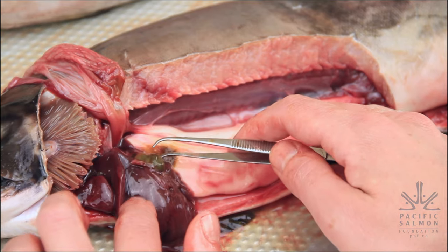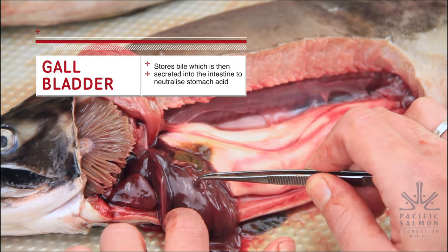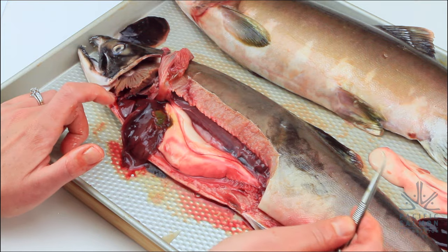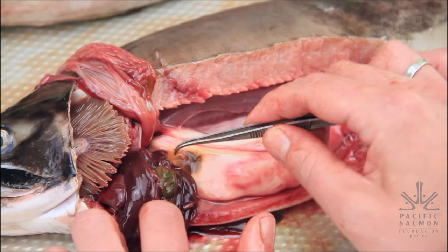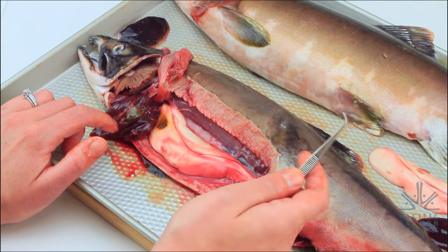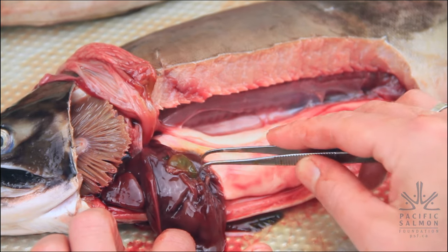Now we can see this green organ here — this is the gallbladder. It was attached to the stomach and is also attached to the liver. The gallbladder in a fish works similarly to yours: it collects and stores bile from the liver, which is then used by the intestine to help digest fat. The color and fullness of the bile in the gallbladder can tell us how recently the fish has eaten. If it's yellow and almost empty, the fish ate within 24 hours. This one is a bluish-green color, meaning this fish hasn't eaten in about a week — which makes sense based on what we saw in its stomach.